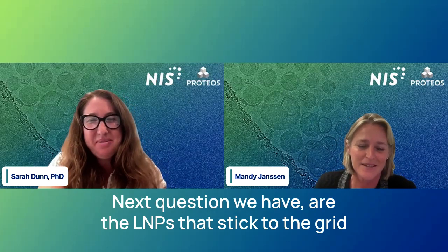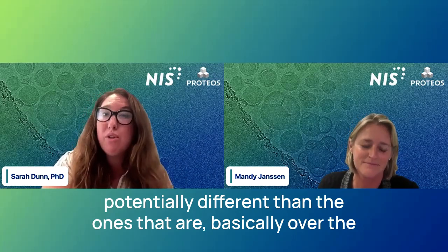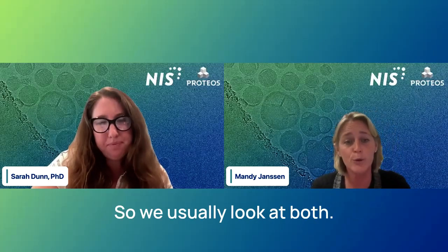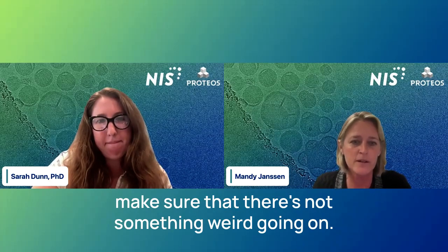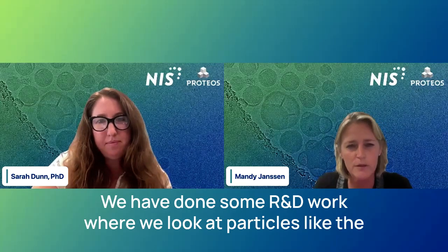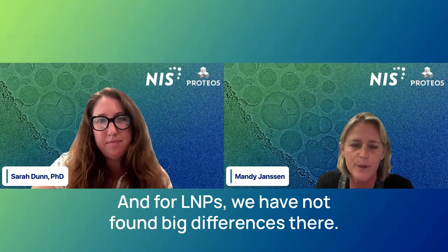All right, next question we have: are the LNPs that stick to the grid potentially different than the ones that are over the holes, in the ice over the holes? I doubt it. We usually look at both. We look at particles on the carbon and in the hole to make sure that there's not something weird going on. We have done some R&D work where we look at the size and the morphology of particles on top of the carbon versus the holes. And for LNPs, we have not found big differences there.